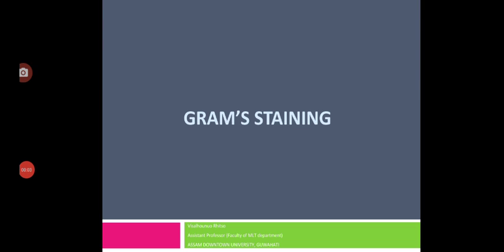Hello everyone, in this video I'll be explaining the topic of gram staining, which is a staining technique done in the lab for diagnosis, differentiation, or detection of bacteria in the patient sample.